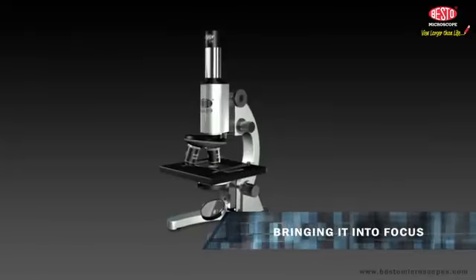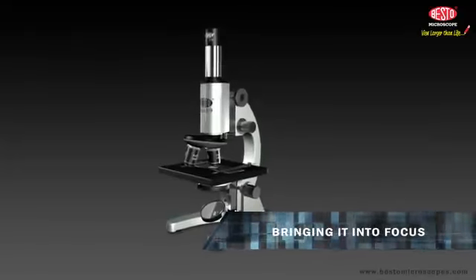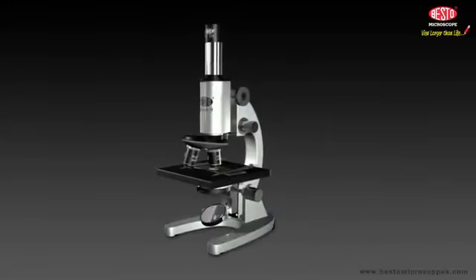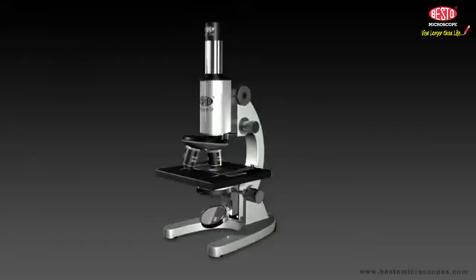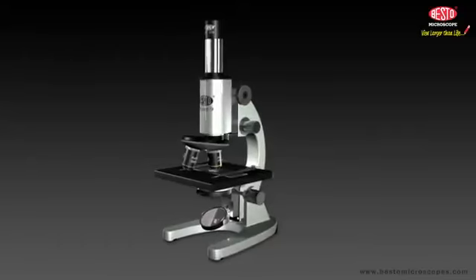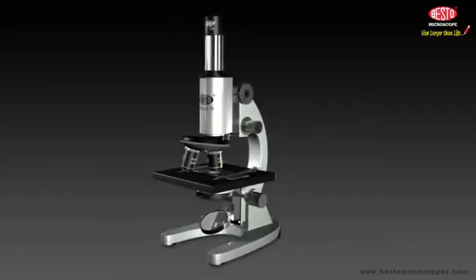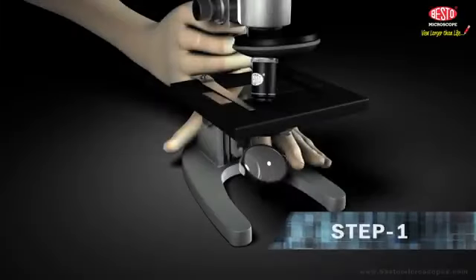Before you use your microscope, you need to know how to set it up properly. This video contains instructions for you to follow. You should come back to here each time you use your microscope until you know the instructions by heart as well as the microscope.